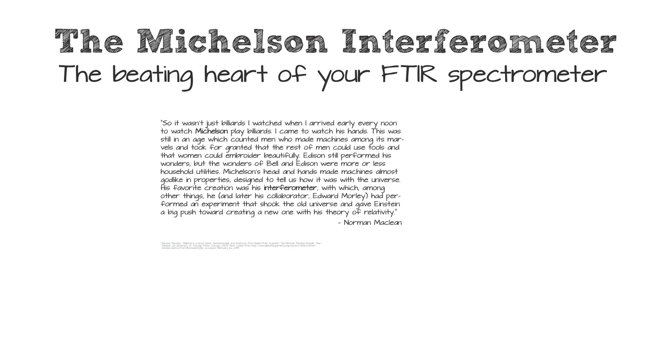And you know, some people, when they listen to a chord played by a whole symphony, can tell you every note that's in that chord. There are people out there that can transcribe an entire symphony just by listening to it. These are the people that have a Fourier transform infrared spectrometer in their brain for music. They can determine every single frequency by listening to the totality of the information. How can we do this with your instrument?